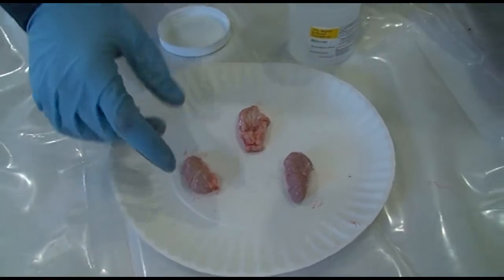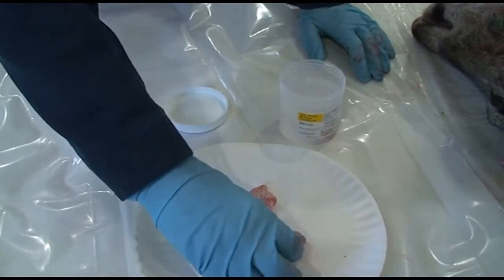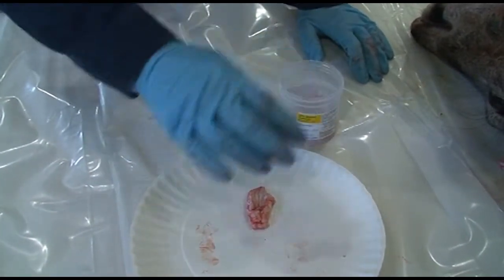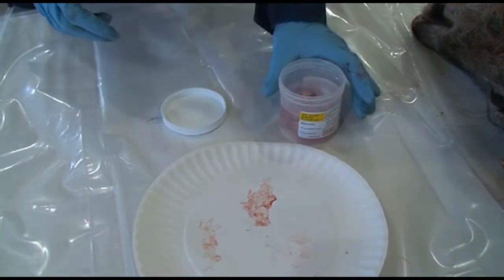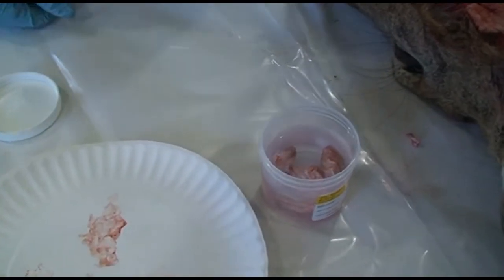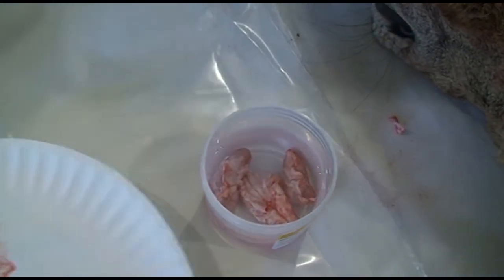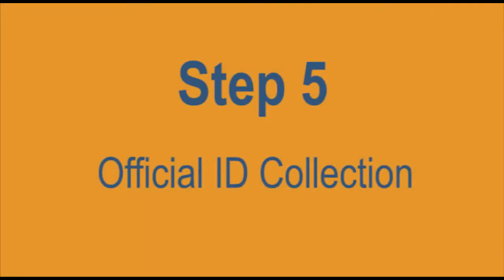And the formalin is a 10% buffered formaldehyde solution. And so it is caustic, considered carcinogenic, so you don't want to get it on you. If you do, you want to wash your hands well, and you don't want to get it splashed in your eyes or anything like that. It would be dangerous.